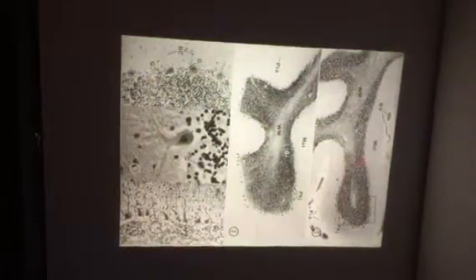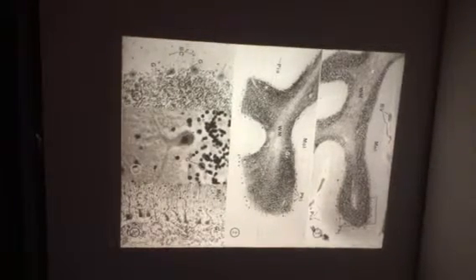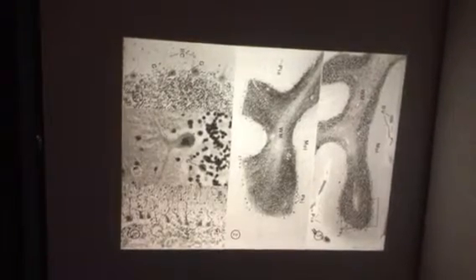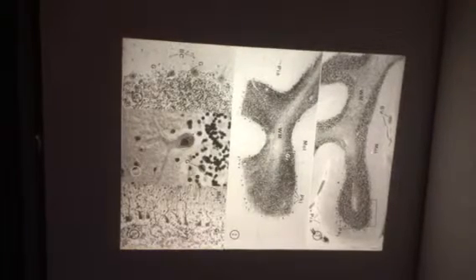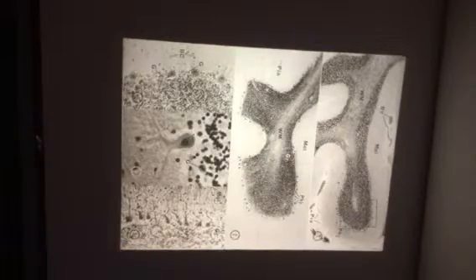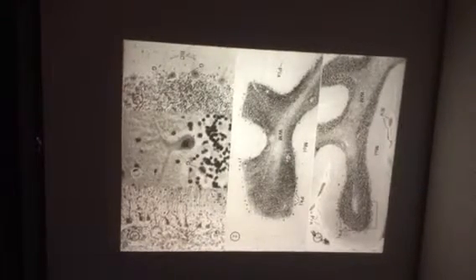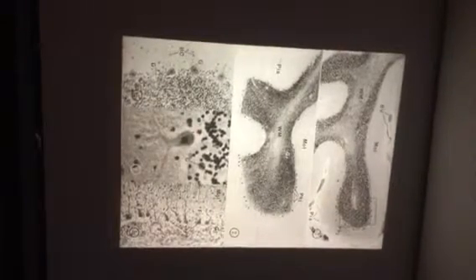What organ do we find here? Cerebellum. And this portion of the cerebellum is what? White matter. And that layer is molecular layer, and this layer is, well, you guys are getting it just like that. And these cells that we see right there, and then again right there, what are those cells?